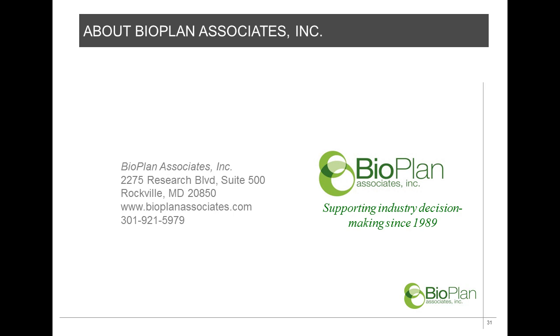For example, if you're evaluating a large-scale facility's economies of scale, or the fact that they have a pre-existing media or buffer kitchen, or that they have a lack of space, or a lack of capital or resources, these are all critical factors that need to be taken into account, not just the scale or the volume, not just that we need X 100,000 liters.